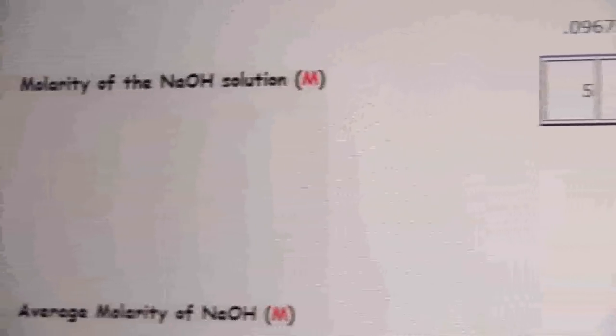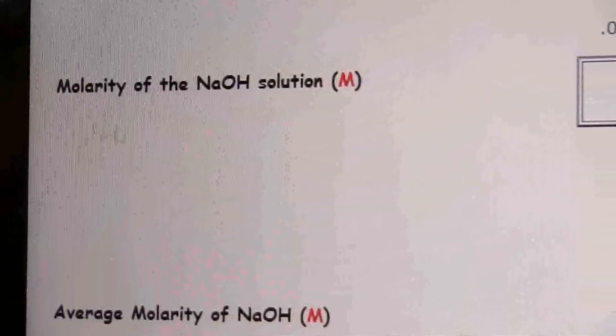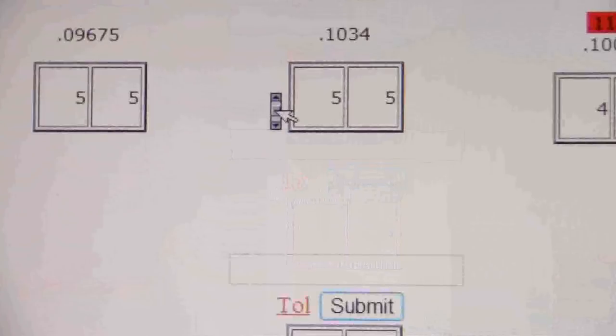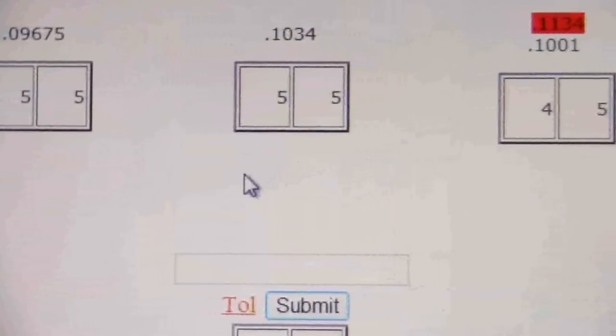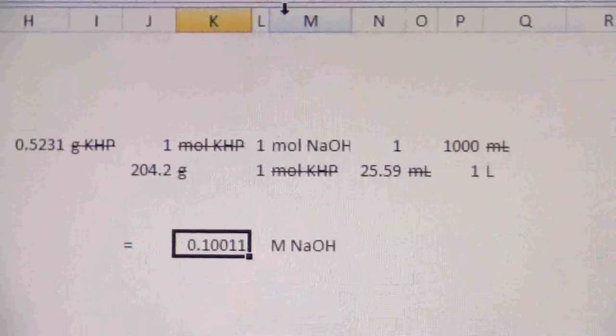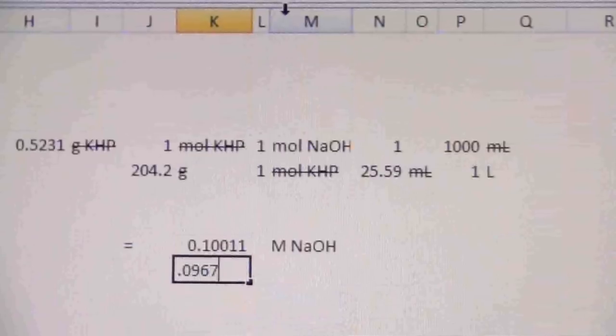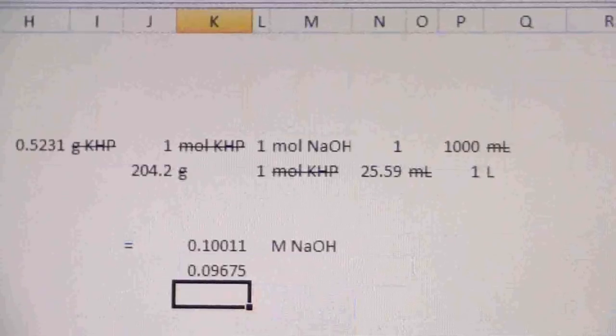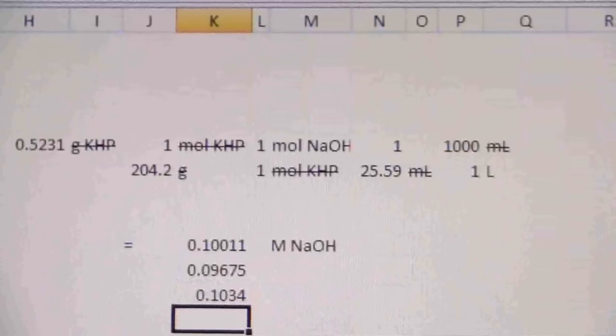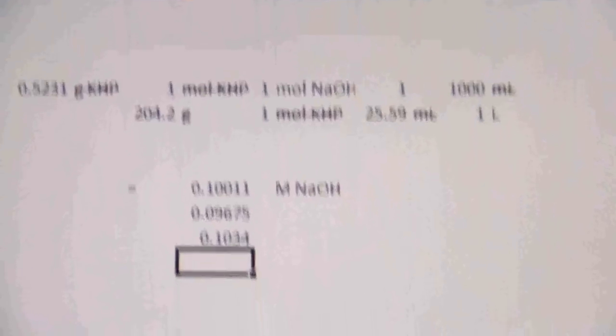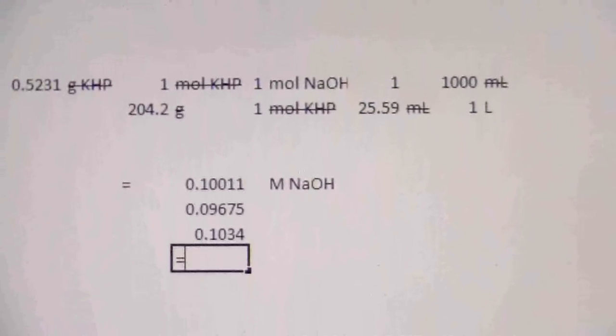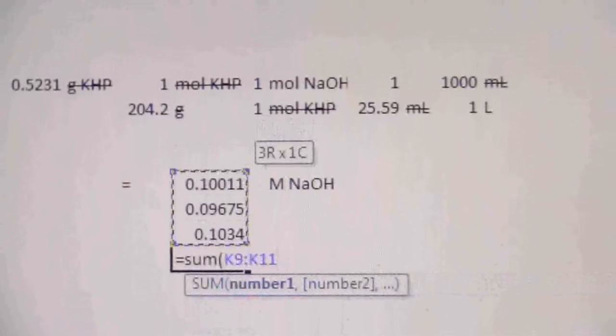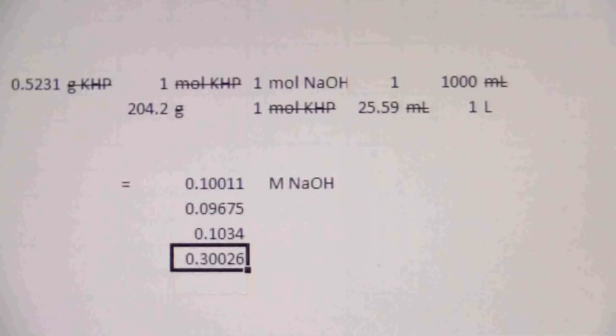So it should take that. Now it's asking for the average molarity of the NaOH. Okay, the average molarity is just going to be the average of these three values. So point zero nine six seven five, I'll go ahead and add these in here. And the second one was 0.1034. Okay, so if I add these together, handy feature in Excel is I can just sum them up and there's my sum and I can divide that by three.